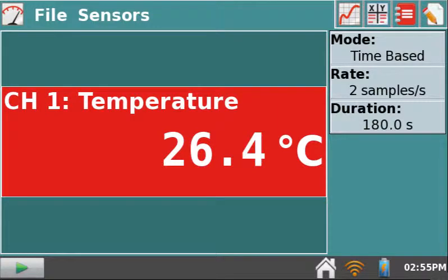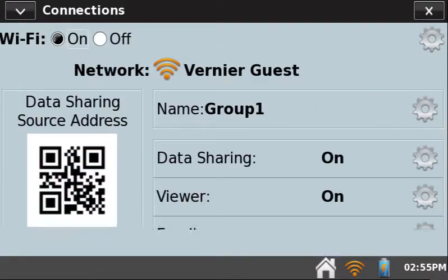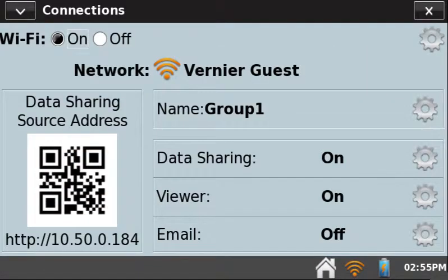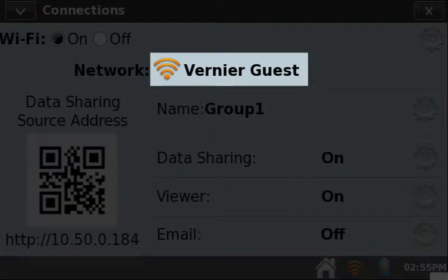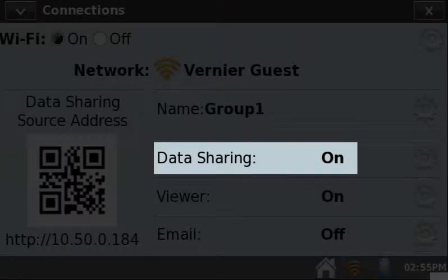You can verify this information by tapping the Wi-Fi icon in the lower right corner of the screen. This launches the Connections app. Note that MyLabQuest is connected to the Vernier Guest Network and data sharing is on.